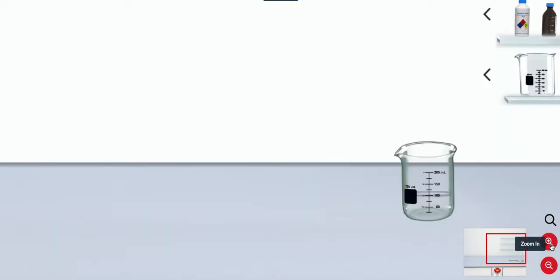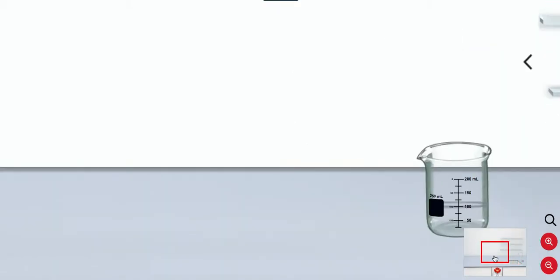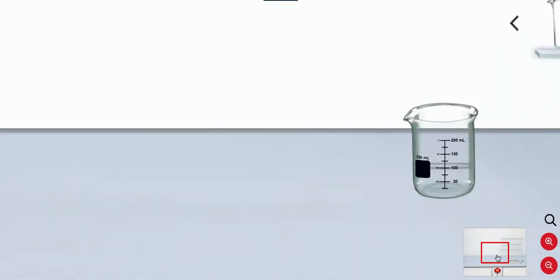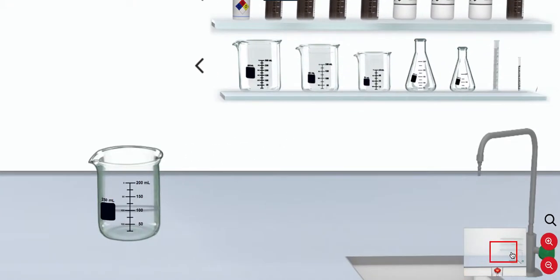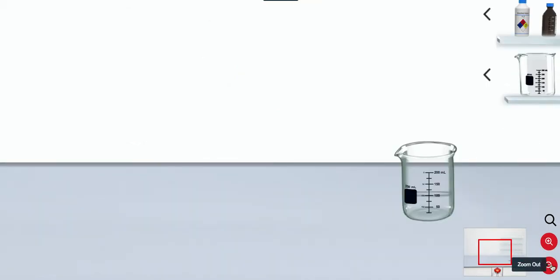In addition, improved zoom and screen mover functionality allows students to get a close-up view of anything anywhere in the lab.